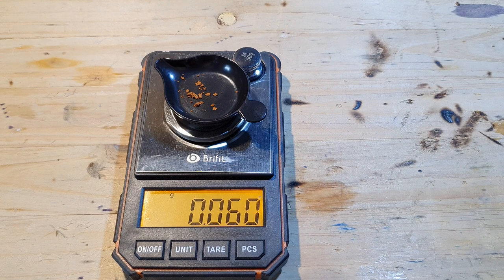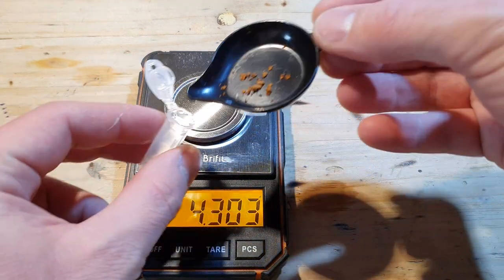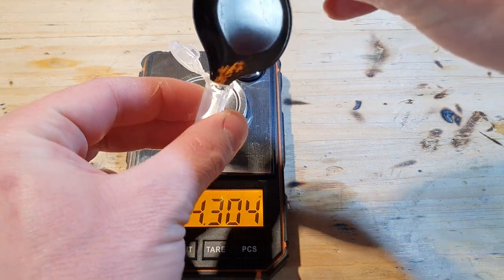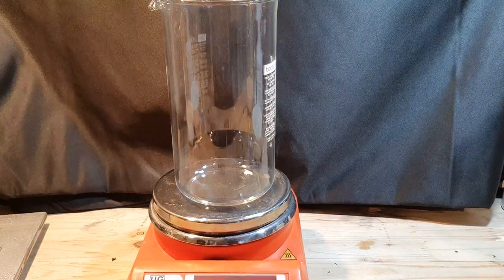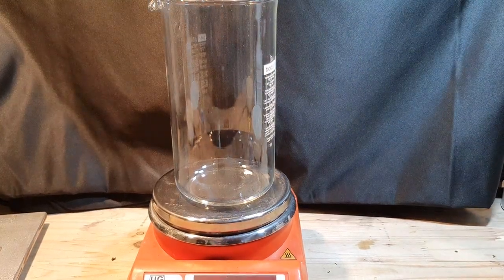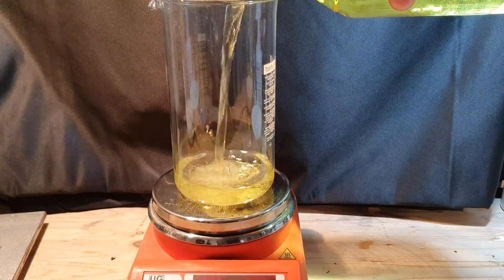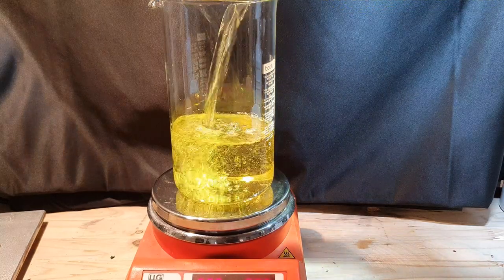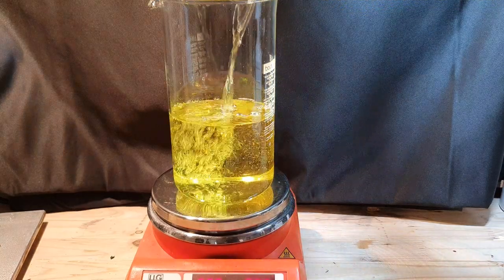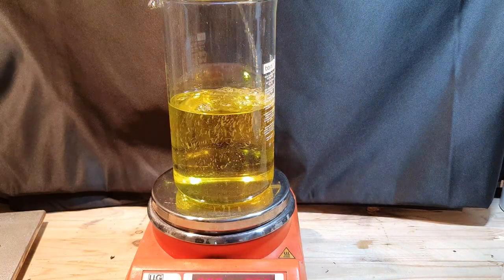I started with 0.8 grams of gold and was left with 0.06 grams. So I decided to combine all of my washing solutions and added some hydrochloric acid to get everything back into solution. Whenever you are doing something like this, it is important to keep all of your waste solutions and your solid waste until you are sure that the process was successful. This way you have a second chance.